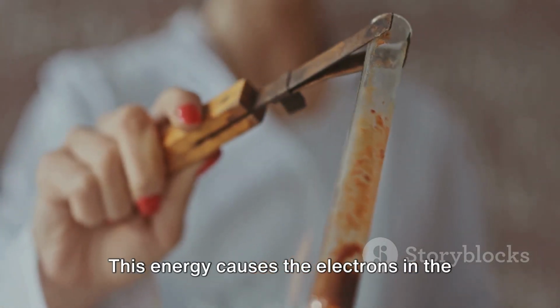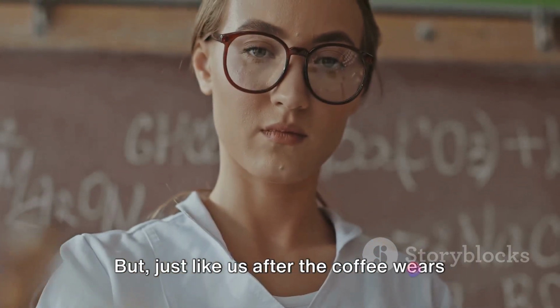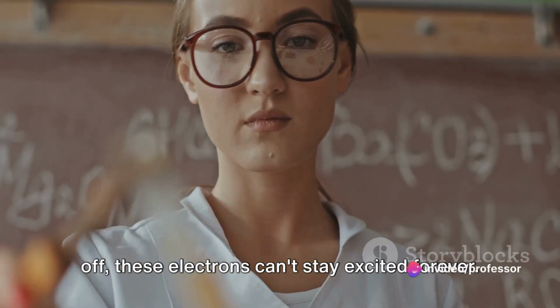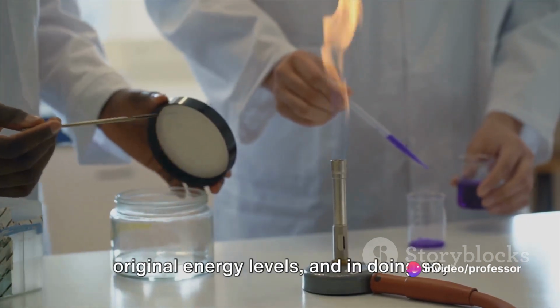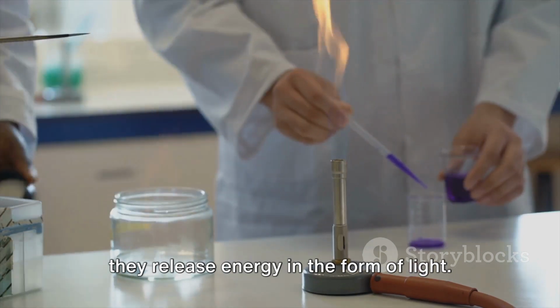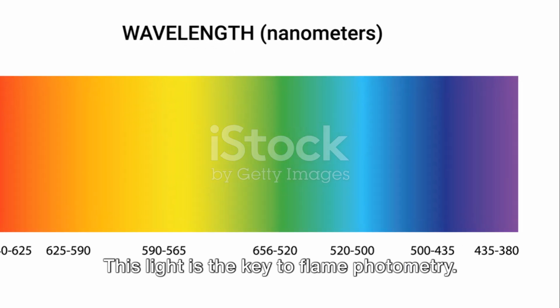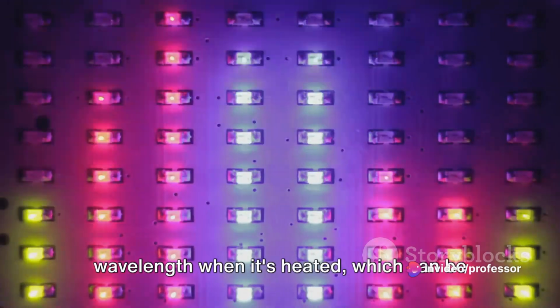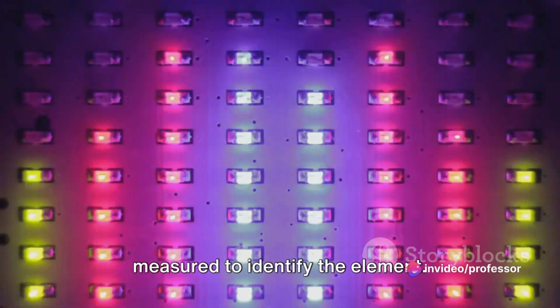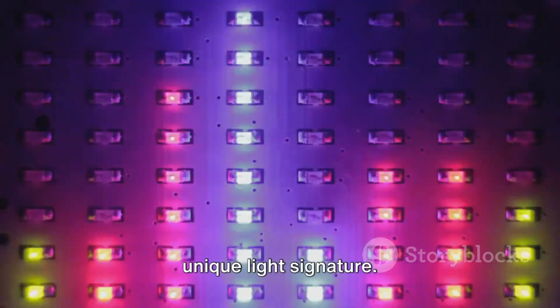This energy causes the electrons in the atom to jump to higher energy levels. But just like us, after the coffee wears off, these electrons can't stay excited forever. They eventually fall back to their original energy levels, and in doing so, they release energy in the form of light. This light is the key to flame photometry. Each element emits light at a unique wavelength when it's heated, which can be measured to identify the element. It's like every element has its own unique light signature.